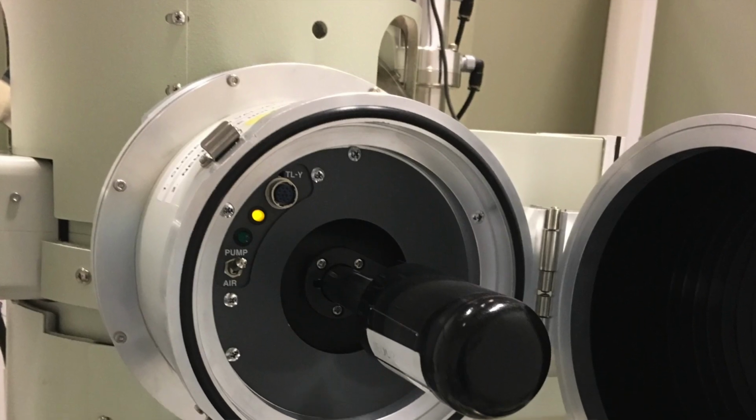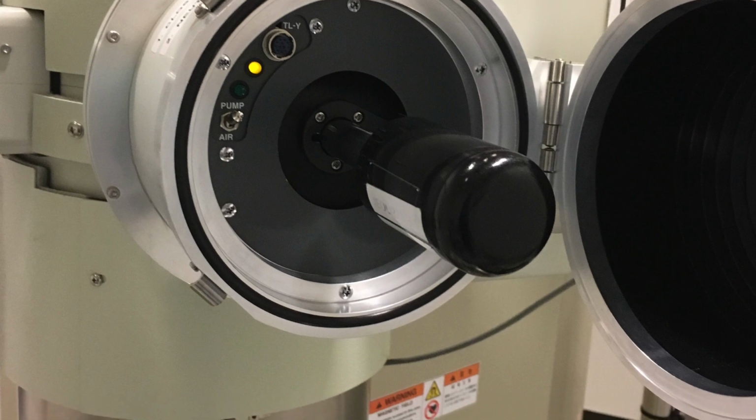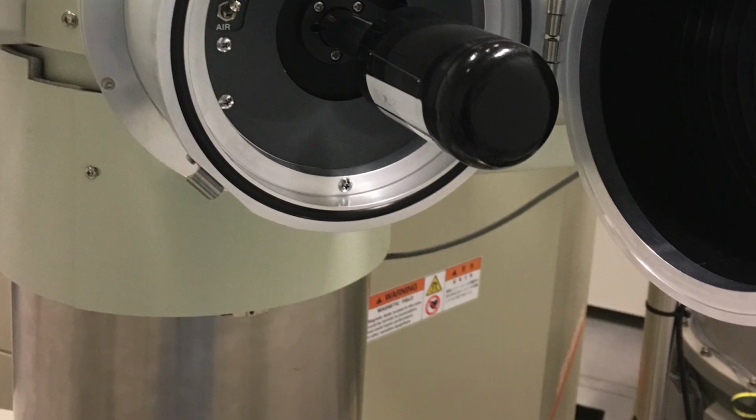Transmission Electron Microscopy, or in short TEM, is a unique and revolutionary technique that enables us to visualize materials with unprecedented detail. It plays a crucial role in advancing our understanding of materials, biological structures, and various phenomena at the atomic level.